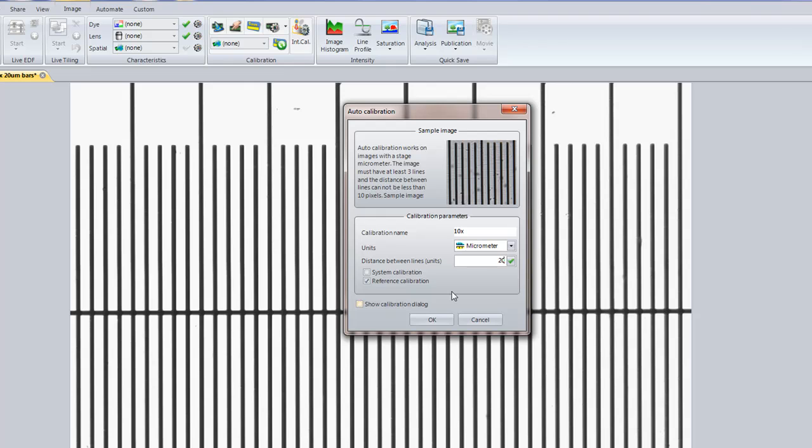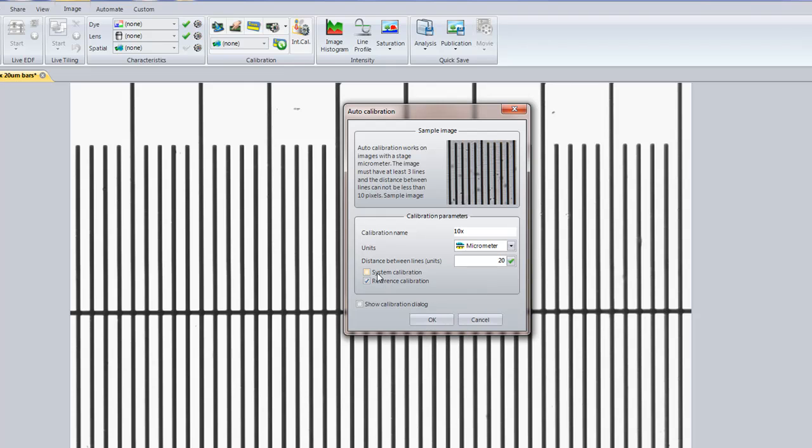And now, I need to make a choice. Do I want this to be a system calibration or a reference calibration? The difference is a system calibration, if I create that, is that calibration that I'm going to create will automatically be used to calibrate images when I capture images through a camera controlled by ImagePro Premiere.